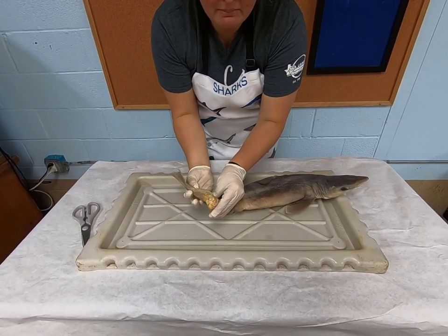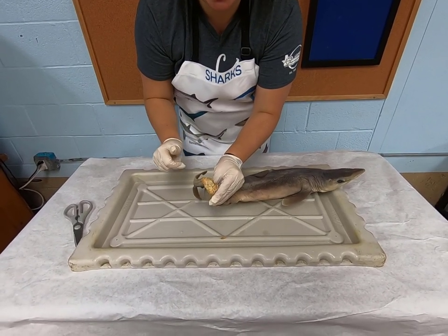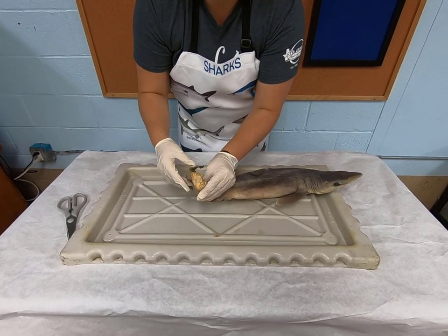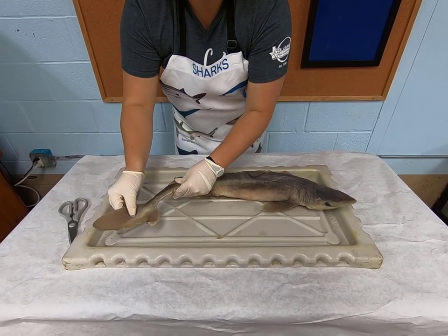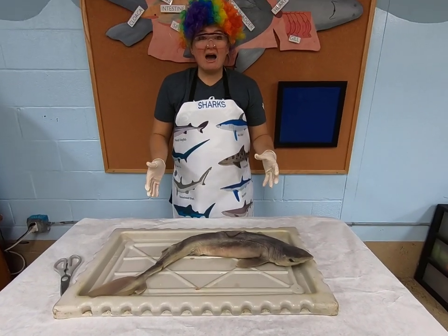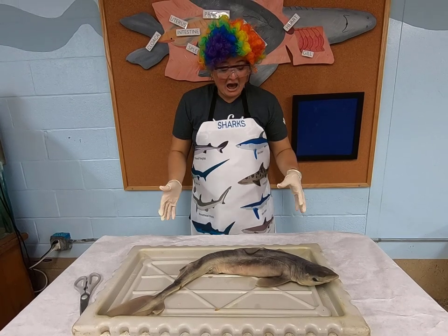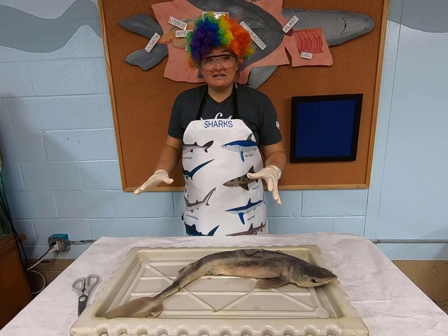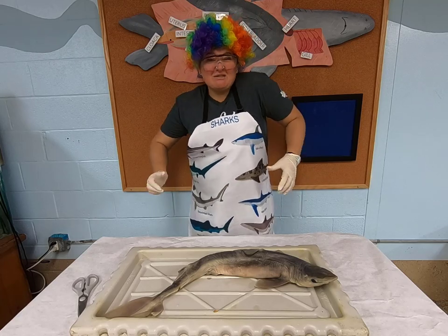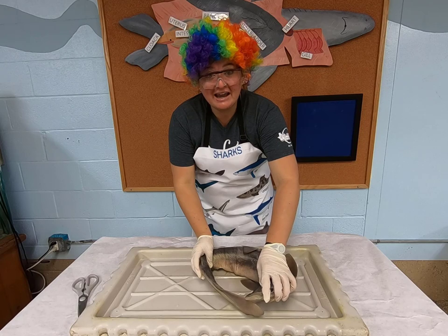And the strongest muscle in their body is actually right here. It's called the caudal peduncle. This muscle right here allows them to power through the ocean and swim really, really fast and be a predator. Now, sharks have what's called a cartilaginous skeleton. They have cartilage all throughout their skeleton so they can move and bend with really great ease. They can move so smoothly in the water. They actually can bend and touch their tail.